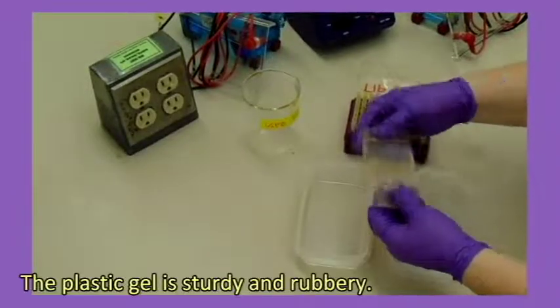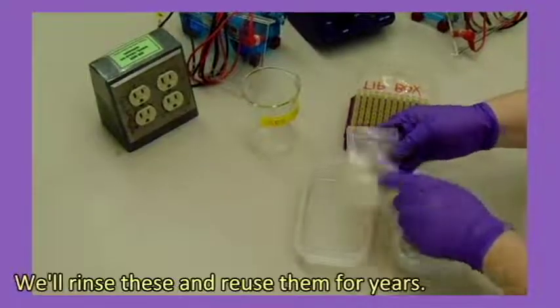The bottoms are sealed so they can hold a tiny amount of liquid. The plastic gel is sturdy and rubbery. We'll rinse these and reuse them for years.